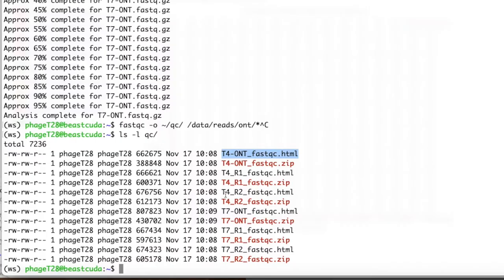To check for contaminants, there are different approaches — one before the assembly and one after. Before assembly, you can run Kraken to detect bacterial reads. Because phage genomes are usually small, it's often easiest to just do the assembly and look for contaminant contigs rather than contaminant reads.